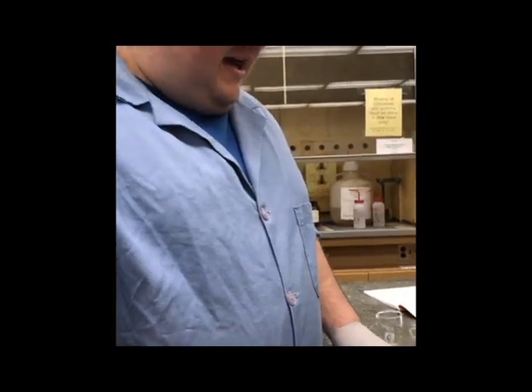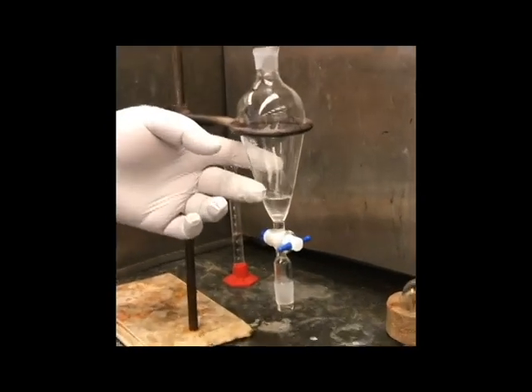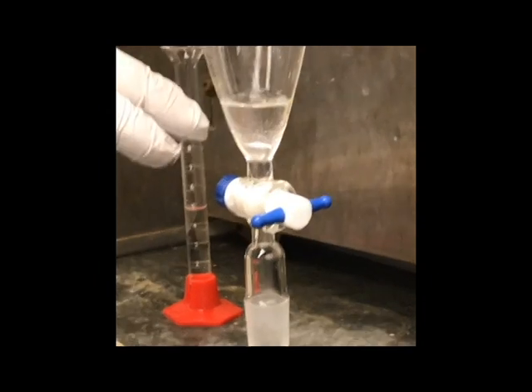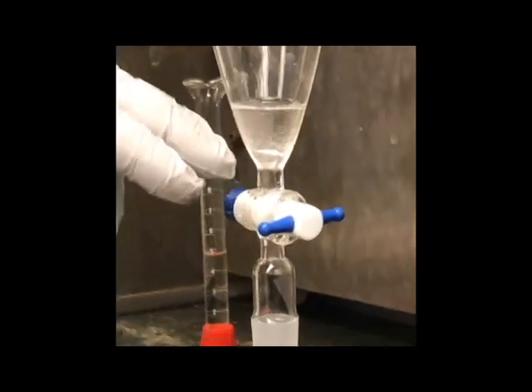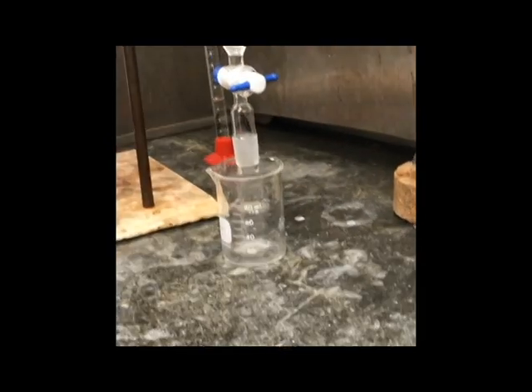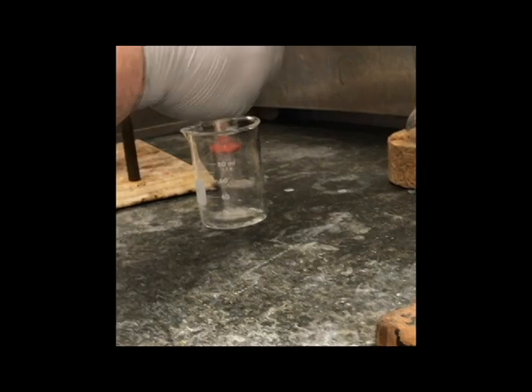So now we have poured our crude reaction material into our separatory funnel. This was in our receiving flask. So now you can see that 2 layers have formed, this top organic layer and the bottom aqueous layer. So now we're just going to quickly separate that into a beaker. Just like so.